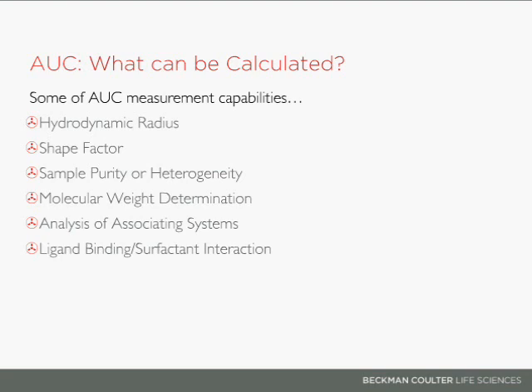So, a quick method comparison. There are a few methods that exist to understand the structural analysis of proteins and nanoparticles. Mass spec, NMR, and X-ray crystallography are very popular, but analytical ultracentrifuge is also popular, and it's the only one of these techniques that can also look at the interactions between nanoparticles in solution.